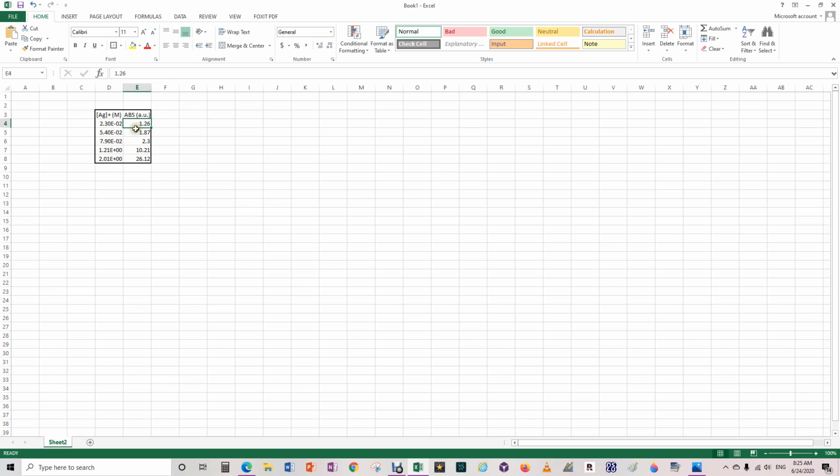And absorbance, most likely, is what you're reading from the spectrometer. So when you look at those 5 numbers, most likely the reading should have 2 digits after the decimal. However, when you type 2.30, it will give you 2.3, so it's not that accurate per se.